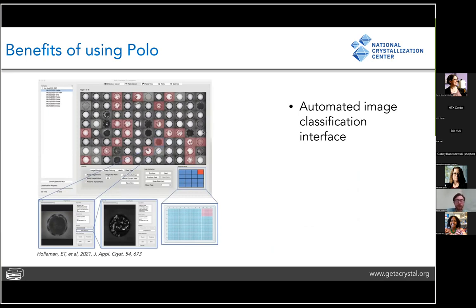And it's kind of similar to the filtering that we did with the slideshow view. You can select a specific classification that you are interested in. It's usually crystals. And have the program highlight those images that have been classified, that classification has been applied to, either by you or the Marco model, in a specific color. So here we're highlighting all of the images that Marco classified as crystal with a confidence greater than, I think, 60% or something around there.